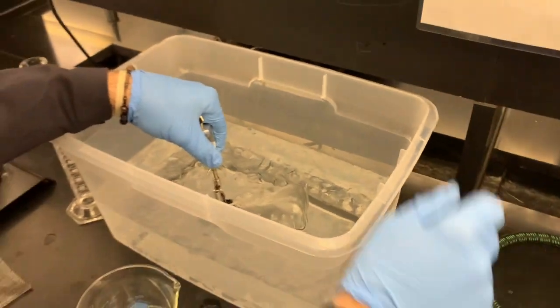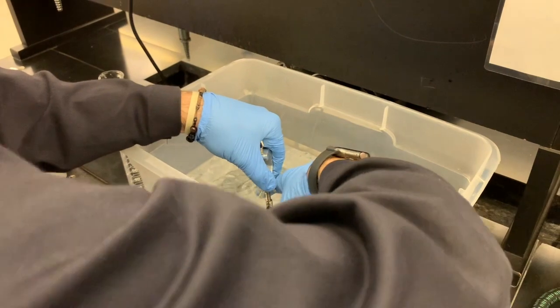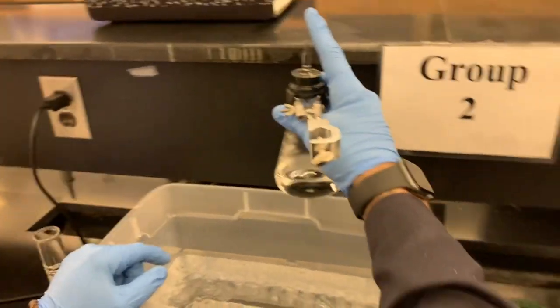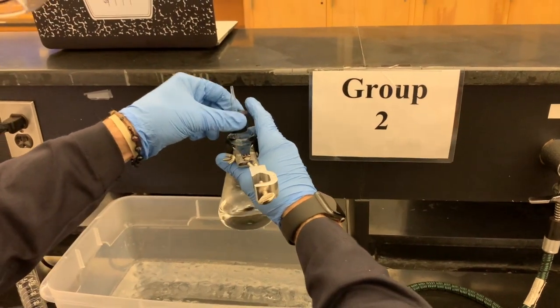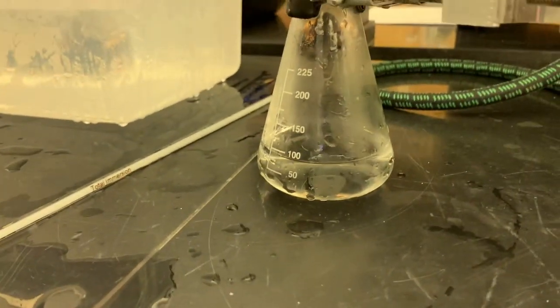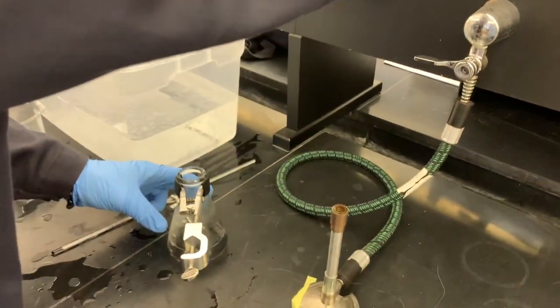And I'm going to hang that as our result. So let me just throw my finger on there, pull our buddy up and see what we got. Oh, I don't want to lose any of that water. There we go. Looks like we got quite a bit more water in there. We'll see what we got. Hopefully nothing too crazy. Maybe there was a leak or something, but who knows? Maybe it was just hotter.